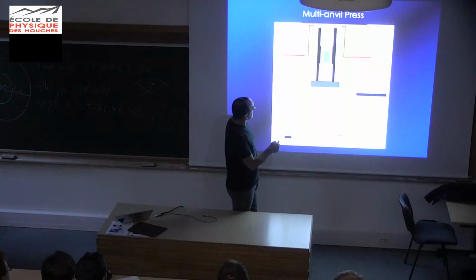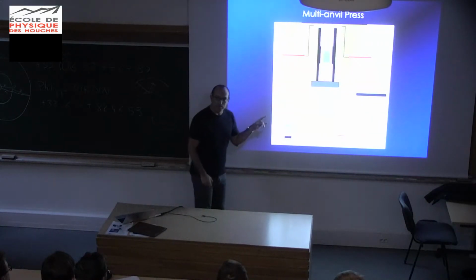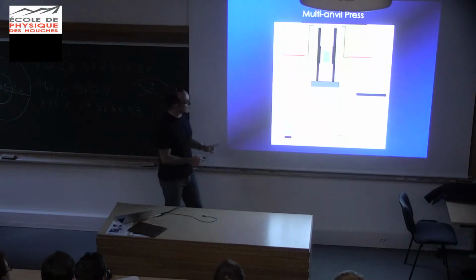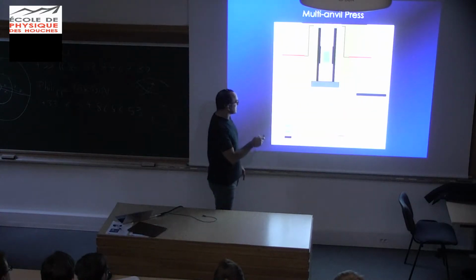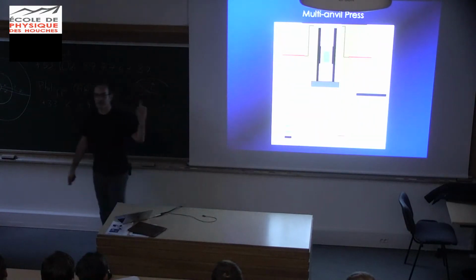So here, if you look, you'll see no graphite. I told you it was identical, but not quite. There is no graphite here, and the furnace is this black material here, which is lanthanum chromite. Do you have an idea why we don't use graphite in this furnace?